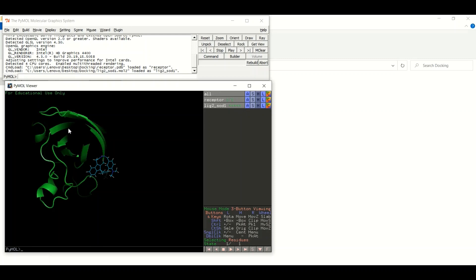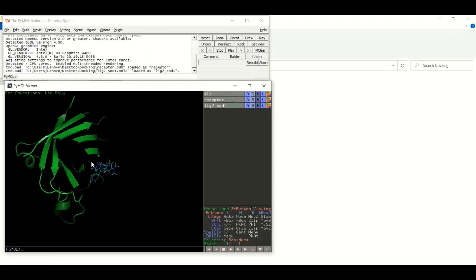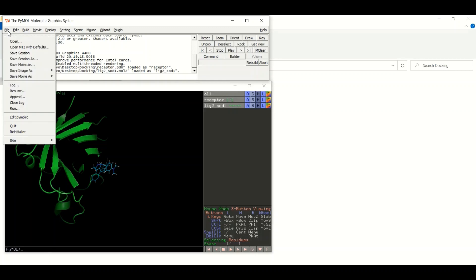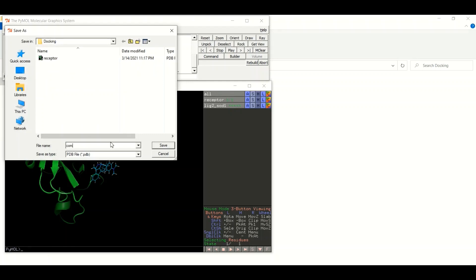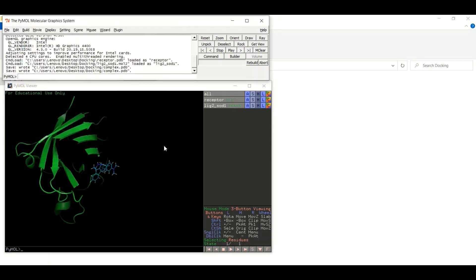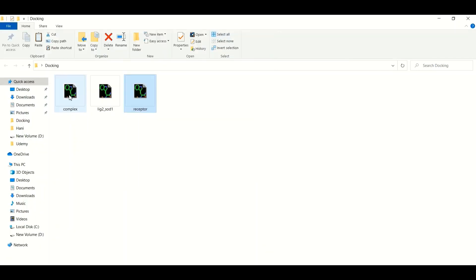The next step is to save both the receptor and the ligand in a complex form. To save them, click on File, then click on Save Molecule, select both the receptor and the ligand, and click OK. Then give a name — for example, 'complex' — and click the Save button. Now our molecule in complex form is saved, with both receptor and ligand together.